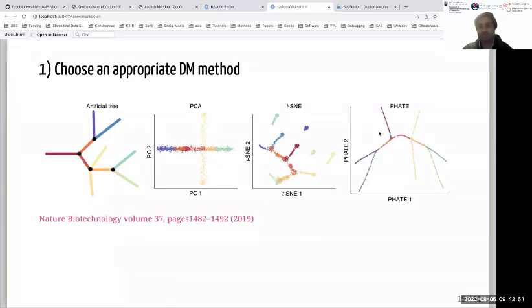In my experience, I try to use a bunch of these methodologies. Obviously, there are some that are not recommended. PCA is not recommended for single cell data, and there are some variants that have been applied to make it work for single cell data. If you're familiar with Seurat, that was covered, there's SCTransform that is used to modify the data prior to PCA.